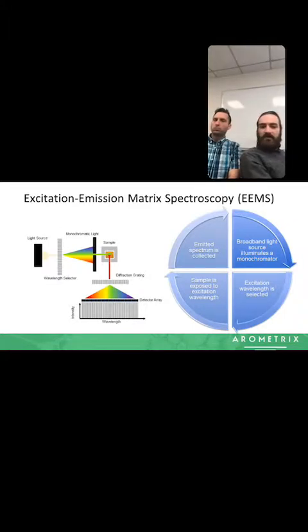If you were to think about this in the visible color spectrum, what that basically means is you have your overhead lighting, and it's got all these colors in it, and that's why it's white. And instead of seeing the white light, we're selecting a specific color like red, green, blue, yellow, whatever in that light, and only letting that light transmit through to our sample.